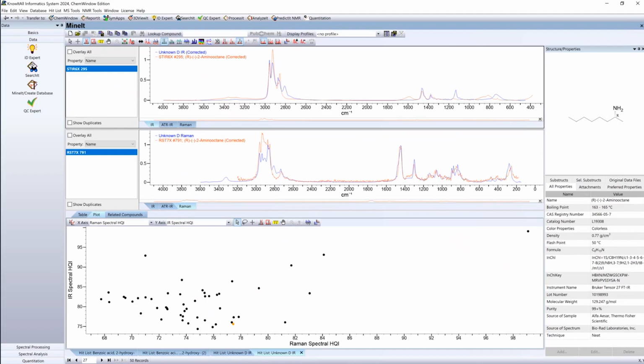Okay, my last demo is going to be our predicted IR library. So this involves a database of predicted IR spectra. Wiley has the world's largest collection of high-quality IR spectra, including Sadtler and Hummel databases. But sample collection is challenging, time-consuming, and costly.